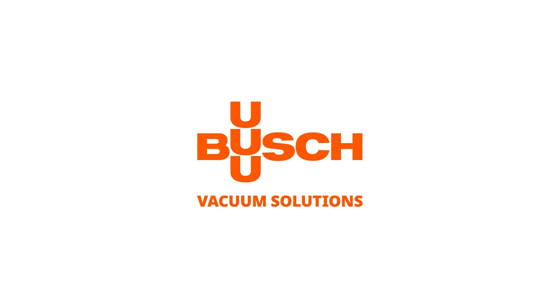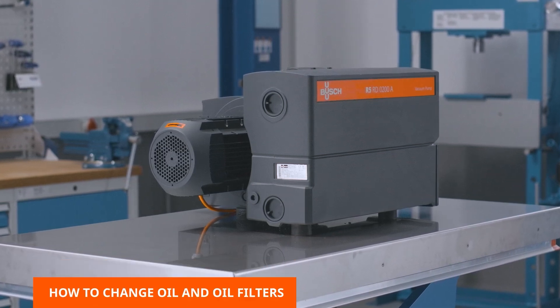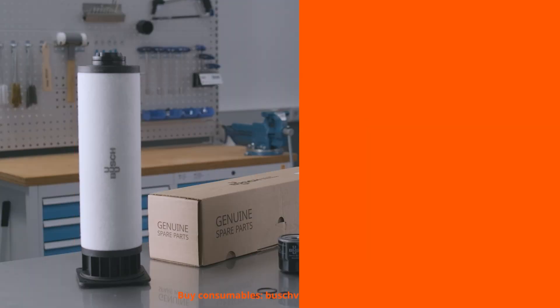Welcome to the Busch maintenance video. This video will show you how to change oil and oil filters in R5RD oil-lubricated rotary vane vacuum pumps. If the oil is dirty and/or too thick, it is time for an oil change to ensure the optimum performance of your vacuum pump.